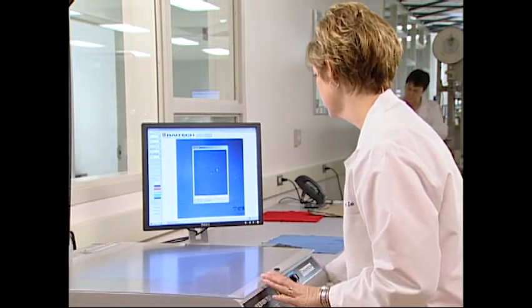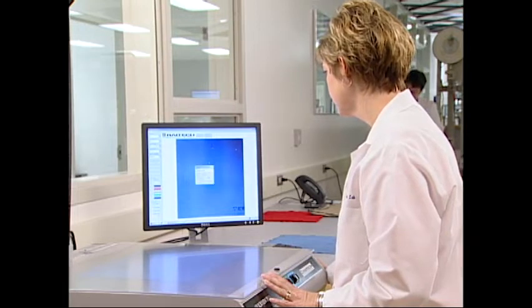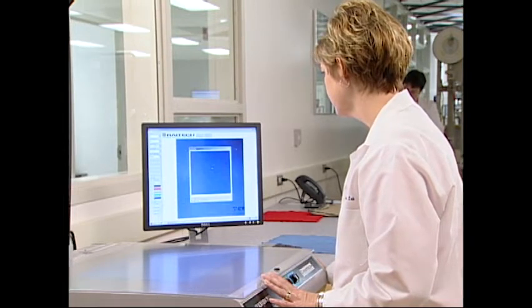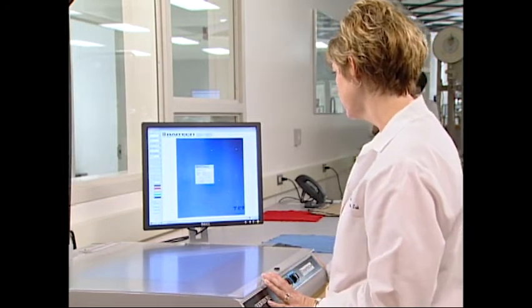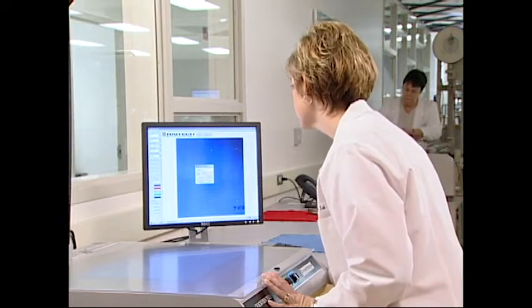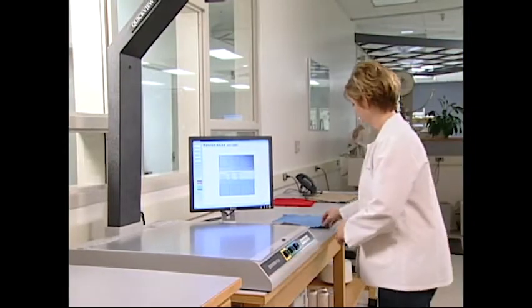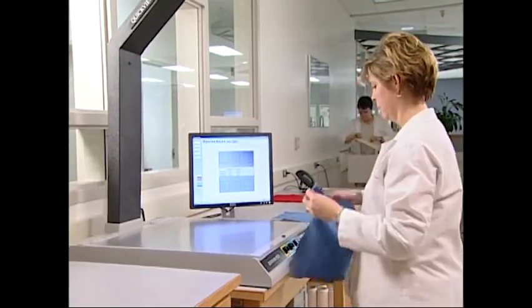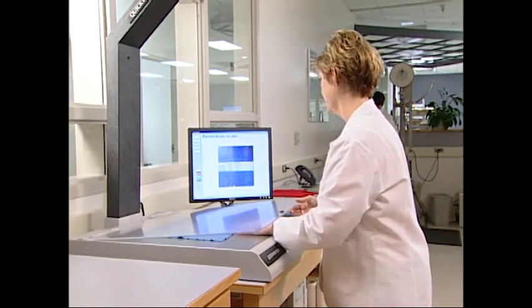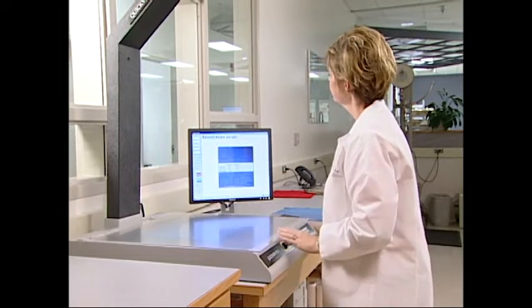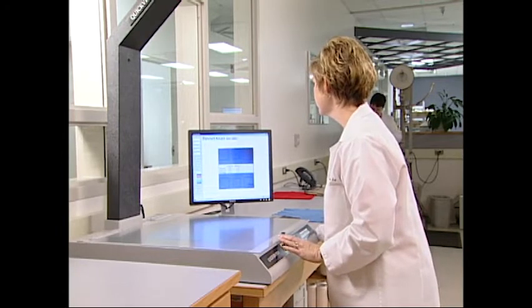SDL Atlas has developed a digital imaging system, QuickView, to automatically measure the dimensional change for fabrics. This system uses a scanning camera to locate the benchmarks prior to laundering. After laundering, the specimens are placed back onto the viewing table of the imaging system for dimensional change calculation. After sampling and before laundering, each specimen with benchmarks is placed onto a viewing table for initializing the imaging system. The benchmarks might not be the exact distance apart; however, this isn't important since the dimensional change will be based on the actual distances before and after laundering.